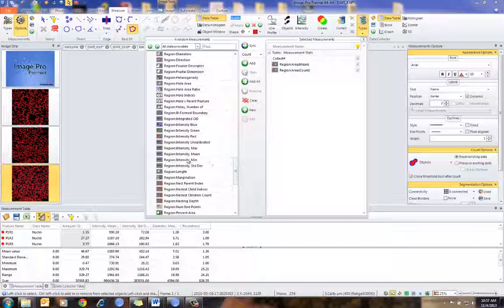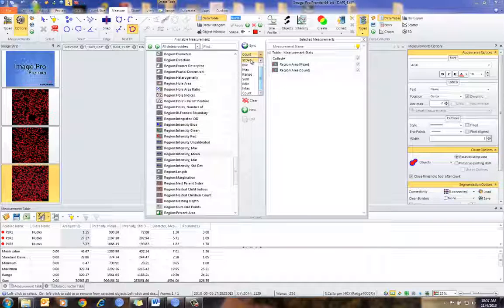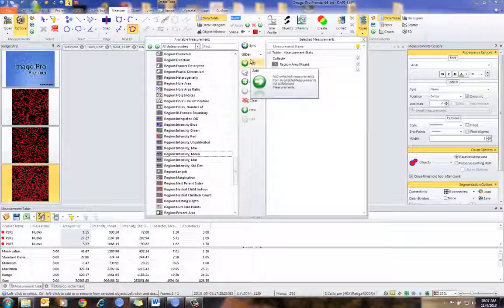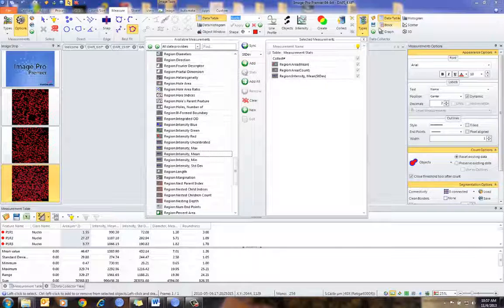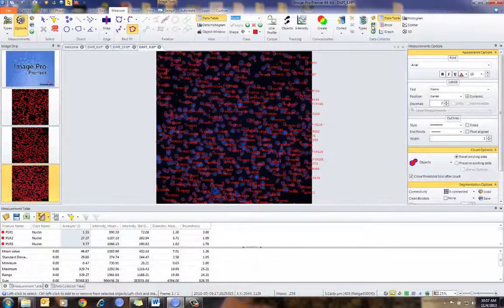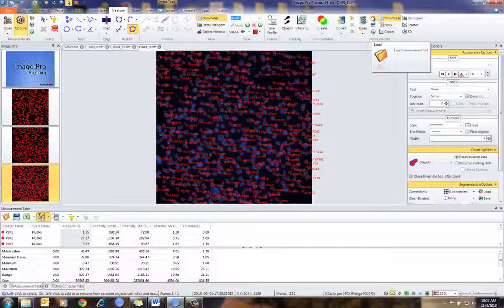I can do this for other parameters that are appropriate. In this case, if I want the mean intensity, I can select that. Maybe I want the standard deviation per nuclei and simply add that. I can come back and save this table and open it for later use.